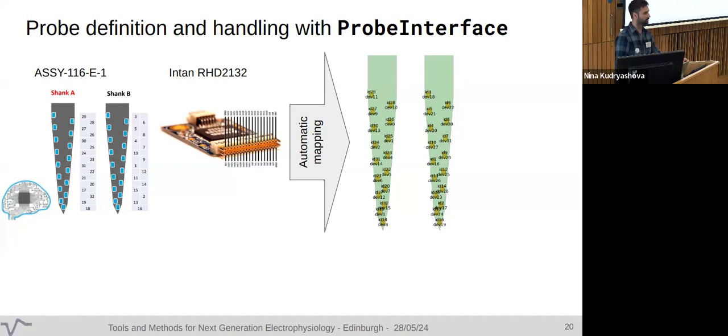Yeah, Andrew. How does this framework deal with programmable probes that might have the same overall layout of all the contacts, but can have some that are active differentially? Like Neuropixels? Yeah. For Neuropixels, since all the switchable configurations are stored in the metadata, the probe object is automatically loaded. So it basically picks the right channels and configuration based on, say, the XML OpenEphys file or the meta file in SpikeGLX. So it's built in two different ways, right?